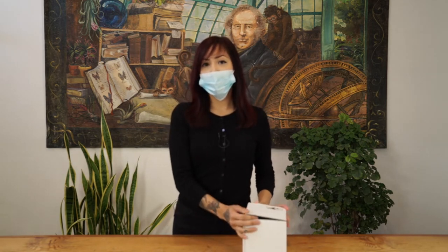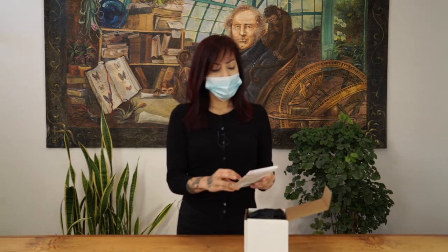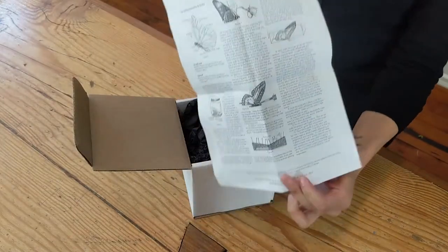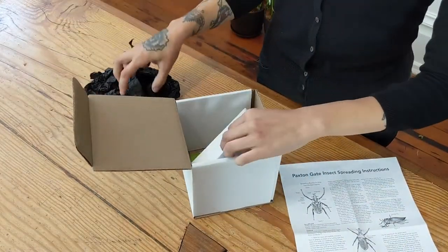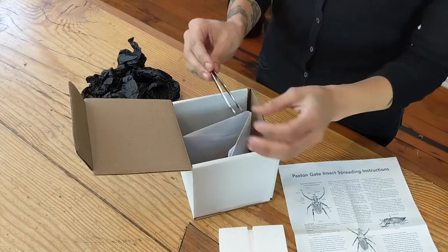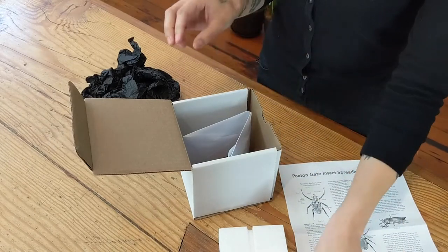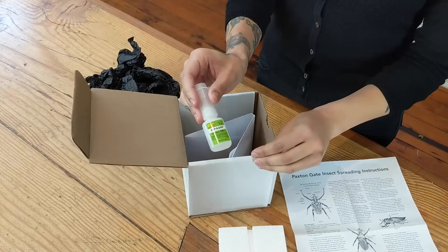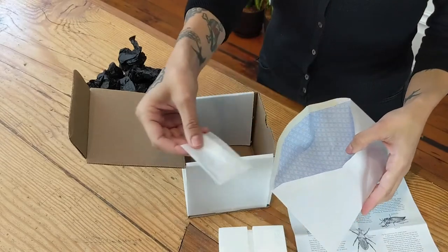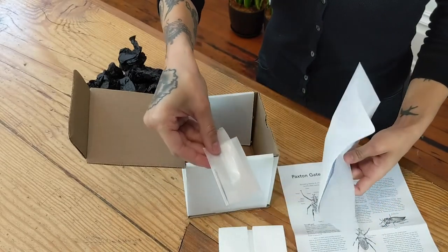This kit will be available online on our website, PaxtonGate.com. It includes step-by-step pinning instructions, a styrofoam spreading board, forceps, zap-a-gap glue, your insect of course, number two pins, parchment paper, and a set of number three pins.